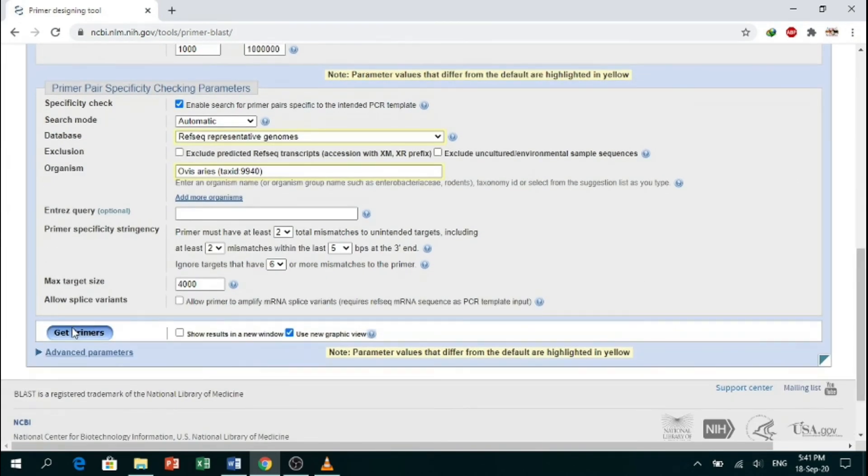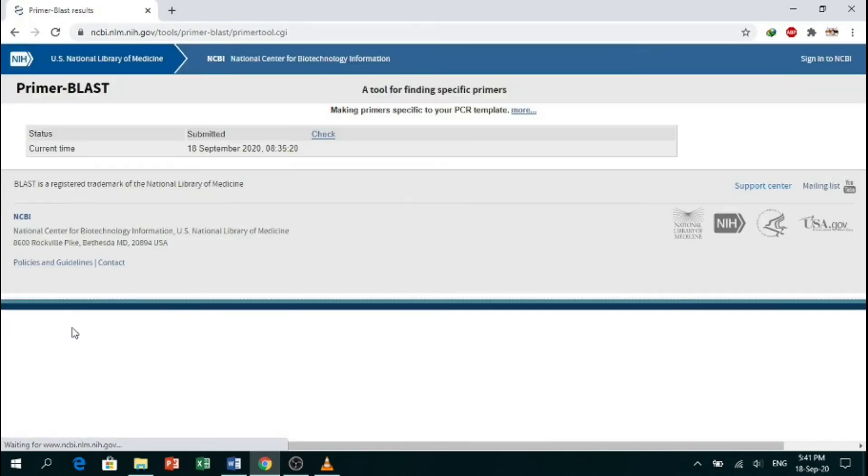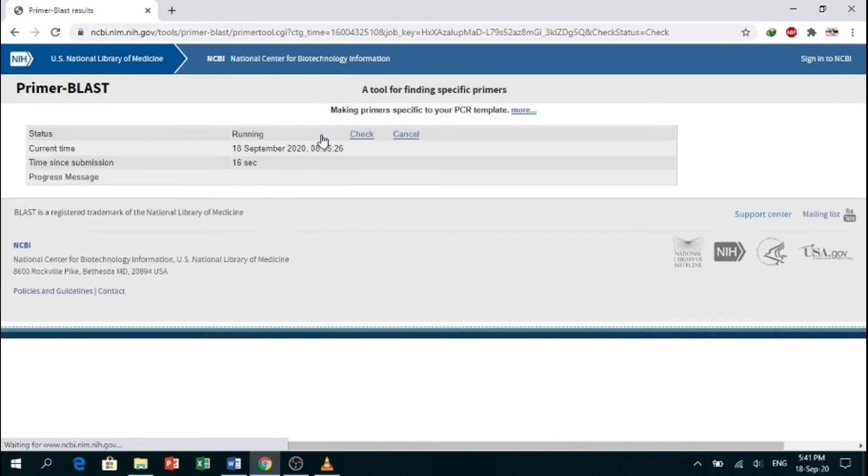It may take a few seconds. Click on 'Check'.